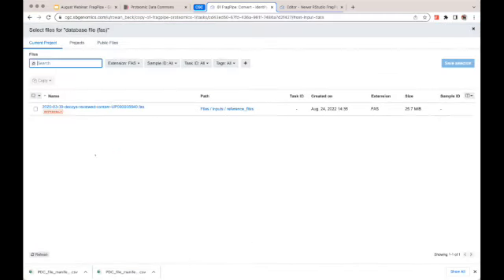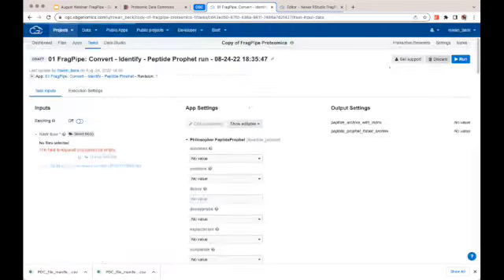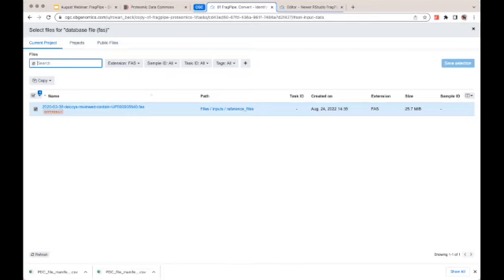Okay, we are going to need a database file. Once you click add file, it will come up. I'll show you that again in case I did it too fast. So you'll click either select files or change selection. Because it's a database file, it has to be .fas, and the system automatically will only give you that option. So it knows that that's what we need to use.